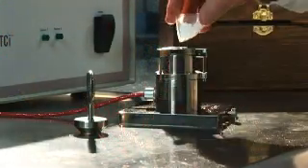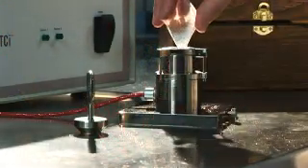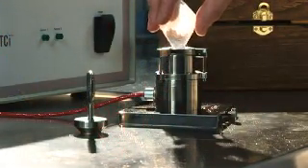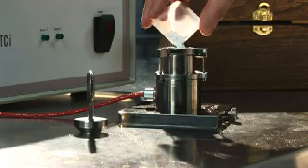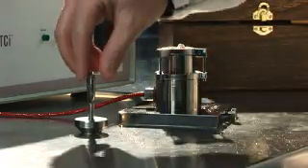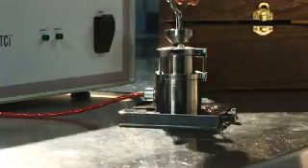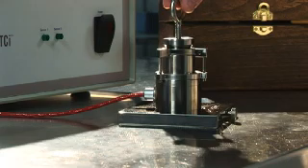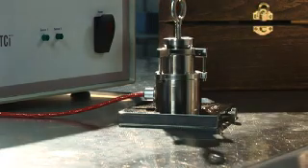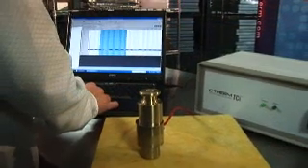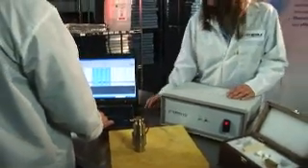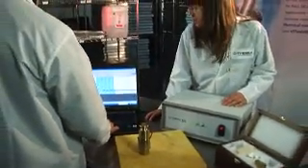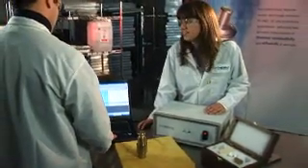C-Therm's TCI is unique when it comes to testing powders — no other commercially available instrument tests powders with such ease. This is a direct result of C-Therm's background in the pharmaceutical industry. Ultimately, the TCI is the lab researcher's first choice in thermal conductivity analysis because it's easy, accurate, and fast.